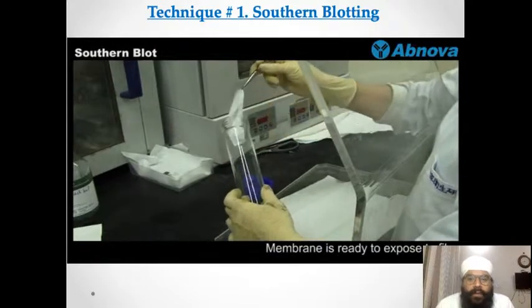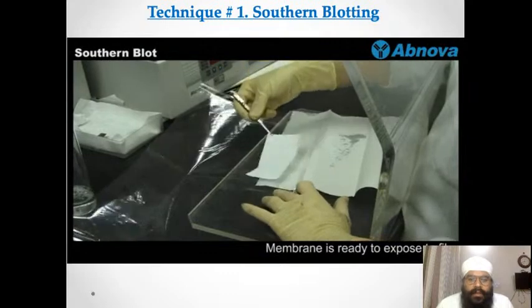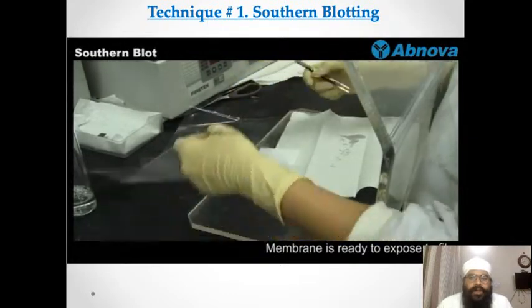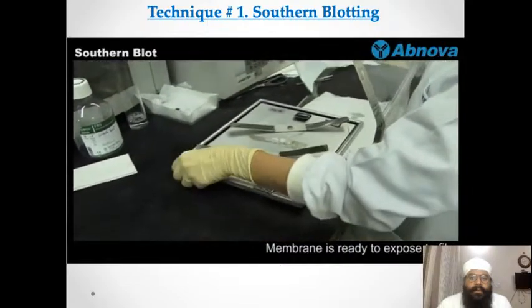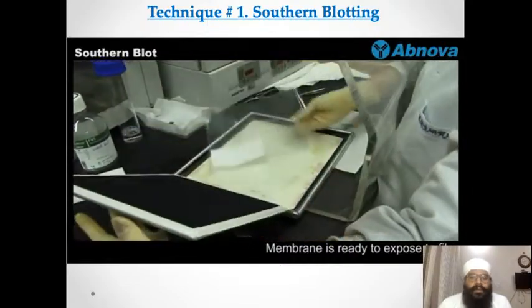Then you wash it, it's ready to expose film with X-rays, and you can watch the membrane later on. That's how it is done. That's it.